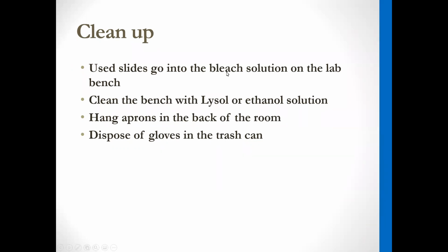like your slides, needs to go into the bleach solution. You're going to always wipe down your bench with either the Lysol solution or ethanol, depending on what's available. Hang your aprons in the back and then throw your gloves in the trash can.